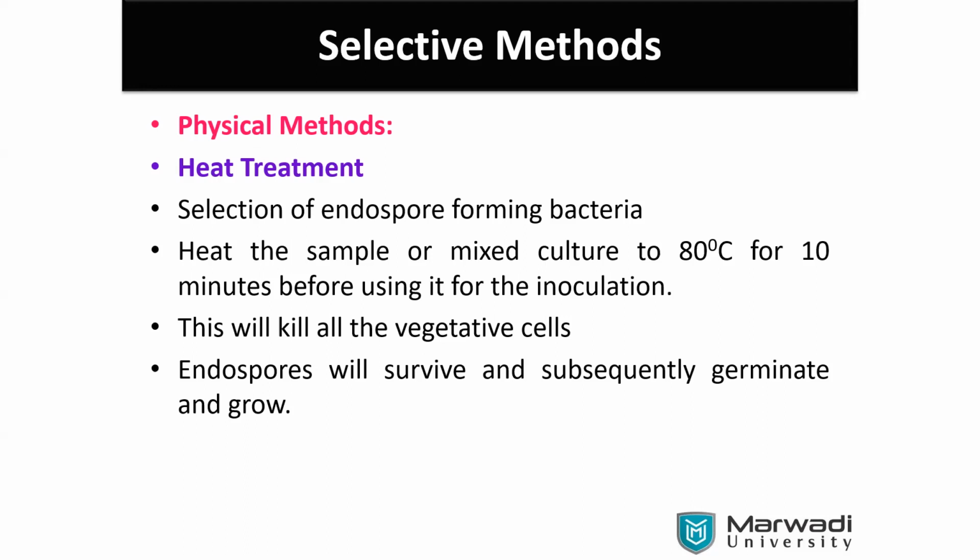You may have taken a thick loop, four or five times, then done the heating. Then you may have done the malachite green with filter papers and everything. You are heating like anything, red hot, that slide maybe. So heat treatment was given.